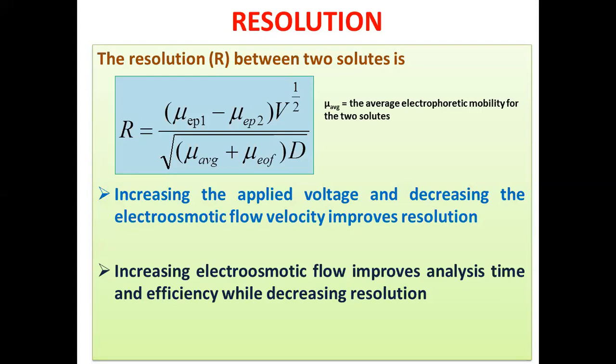In chromatography, resolution can be obtained from the relationship between the retention times and the baseline widths of two solutes. R is equal to 2 times delta TR divided by W1 plus W2. If two solutes are eluted one by one, having retention times of T1 and T2 and chromatographic baseline widths of W1 and W2 respectively, the resolution can be written as 2 times (T2 minus T1) divided by (W1 plus W2). You know this expression. In chromatography we use that expression to calculate the resolution.